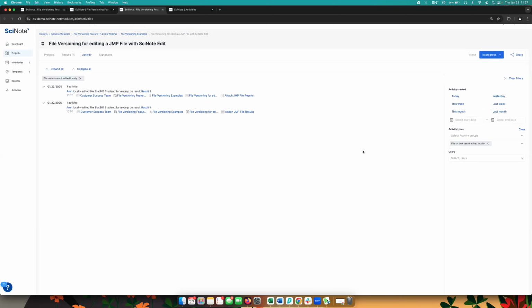And that's all we had for today in terms of what we wanted to cover, but we do have a few more minutes, so we'll open it up for questions if there are any. And Arun, we do have one question so far. Someone had asked, can we please show how to access the audit trail one more time?